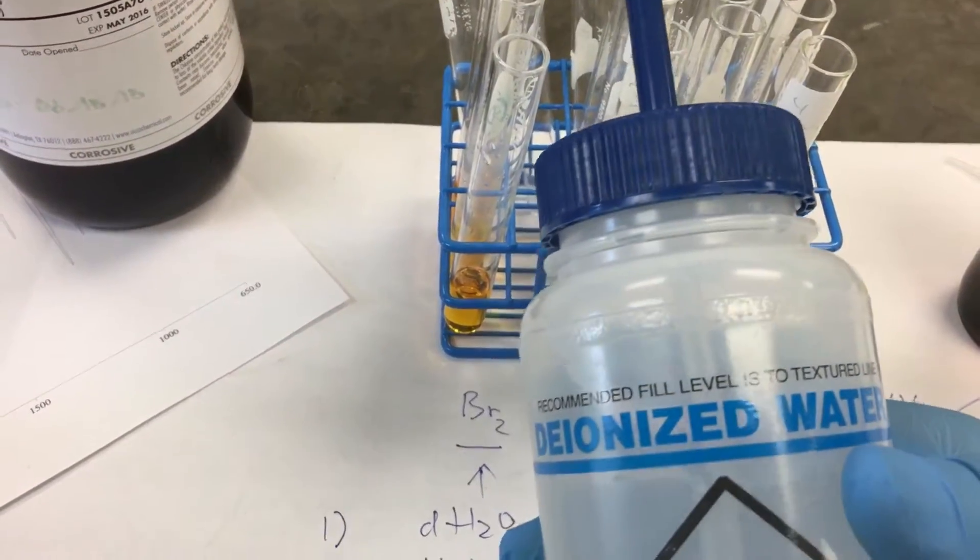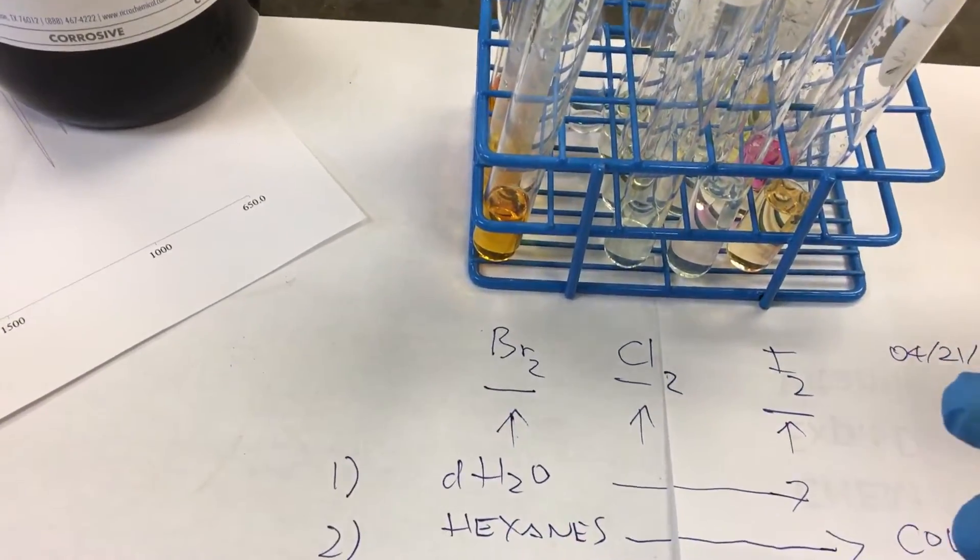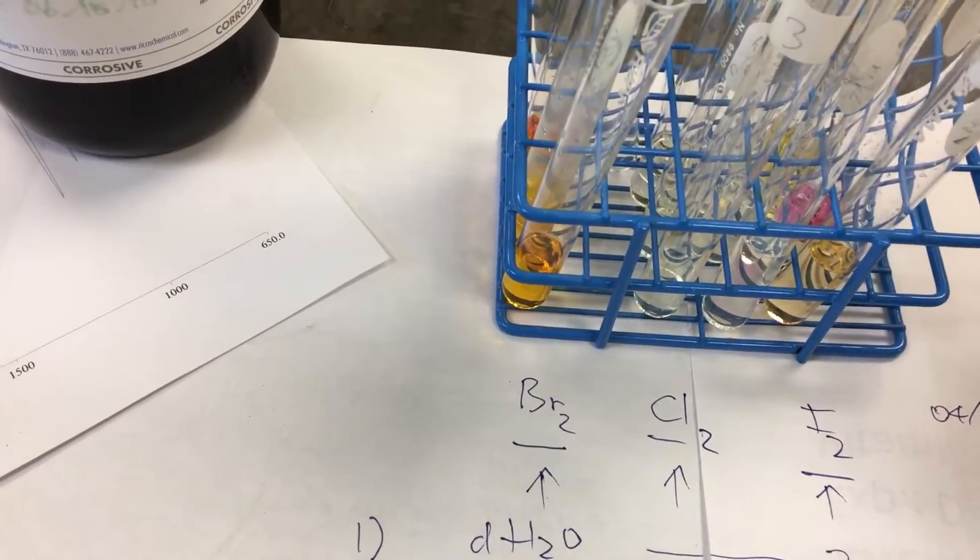Deionized water. We're going to retest. I'm going to retest the chlorine satellite water with deionized water.